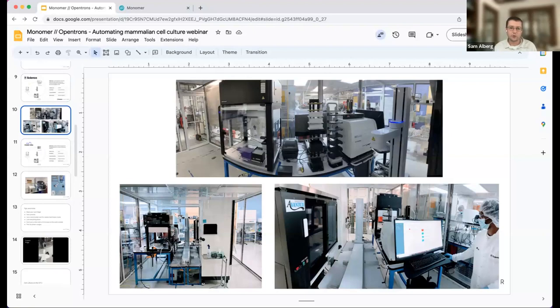Another question: is there a preferred equipment list with existing drivers? Yeah, we have a library of 30 or 40 drivers for equipment that we have worked with and have preferences for, but we're also open to adding support for new instruments if there are things that you like or already have that we haven't connected with. We're happy to figure that out. It typically takes approximately 2 weeks for us to build a new connection to a device. It depends on the complexity of the API, but that's the typical 2 week mark.